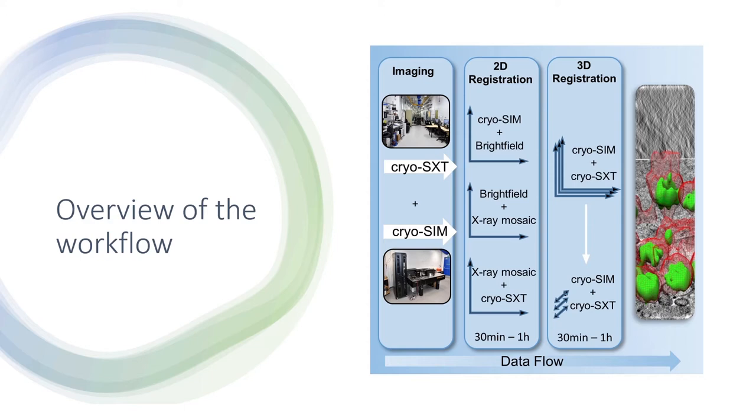This is then used to generate a transformation schema file. This is added onto the SIM image to transform it in XY and then we can do 3D registration to transform it in Z with respect to the tomogram.